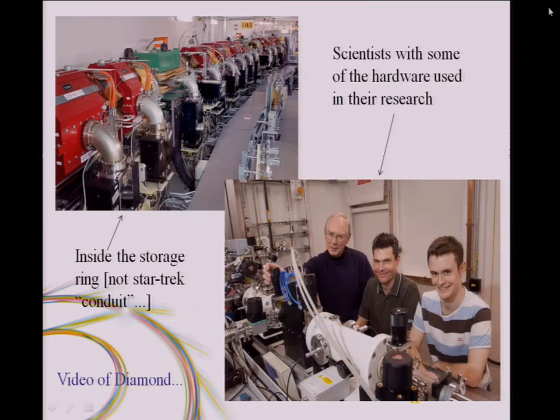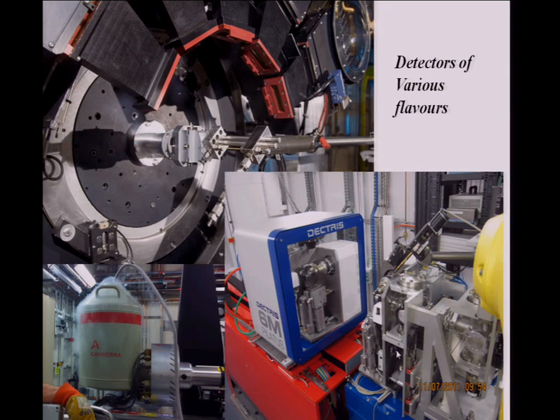Right, that's going to repeat, so we'll stop that. Okay, so the detectors, basically, all the software we create is just dealing with great big arrays of numbers. The arrays might be one-dimensional, two-dimensional, three-dimensional, or n-dimensional. But basically, it's a way of having a great big stream of numbers that are recorded in some way, and then from that file are visualized.